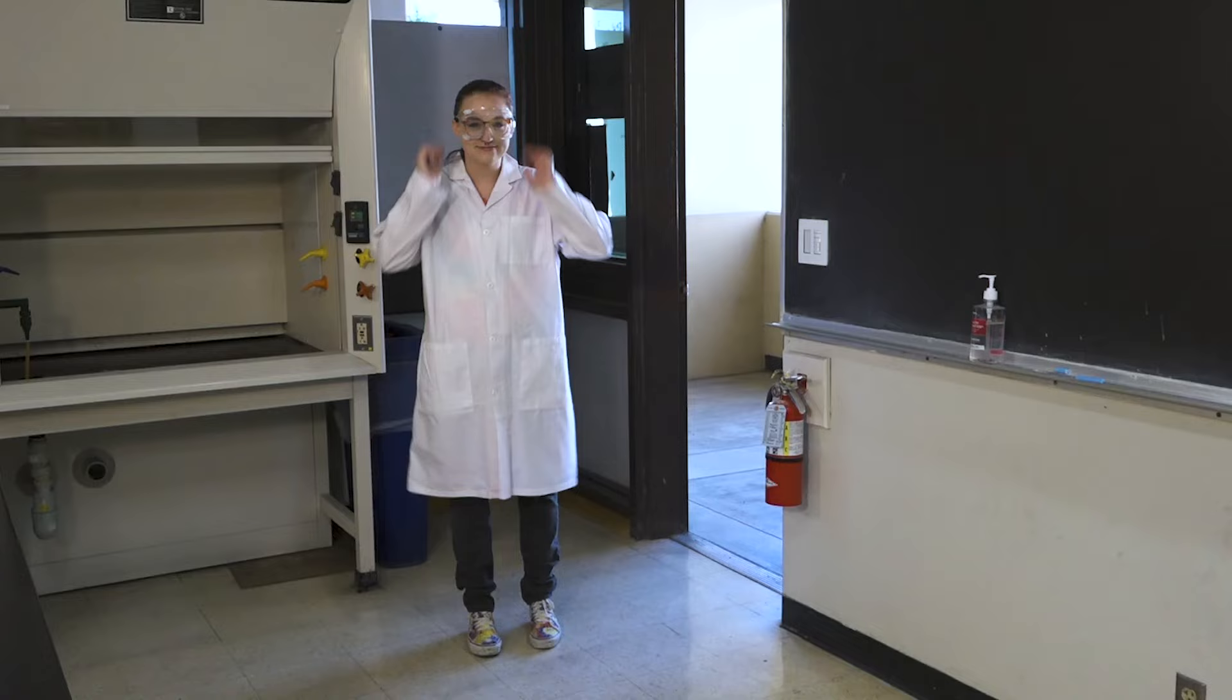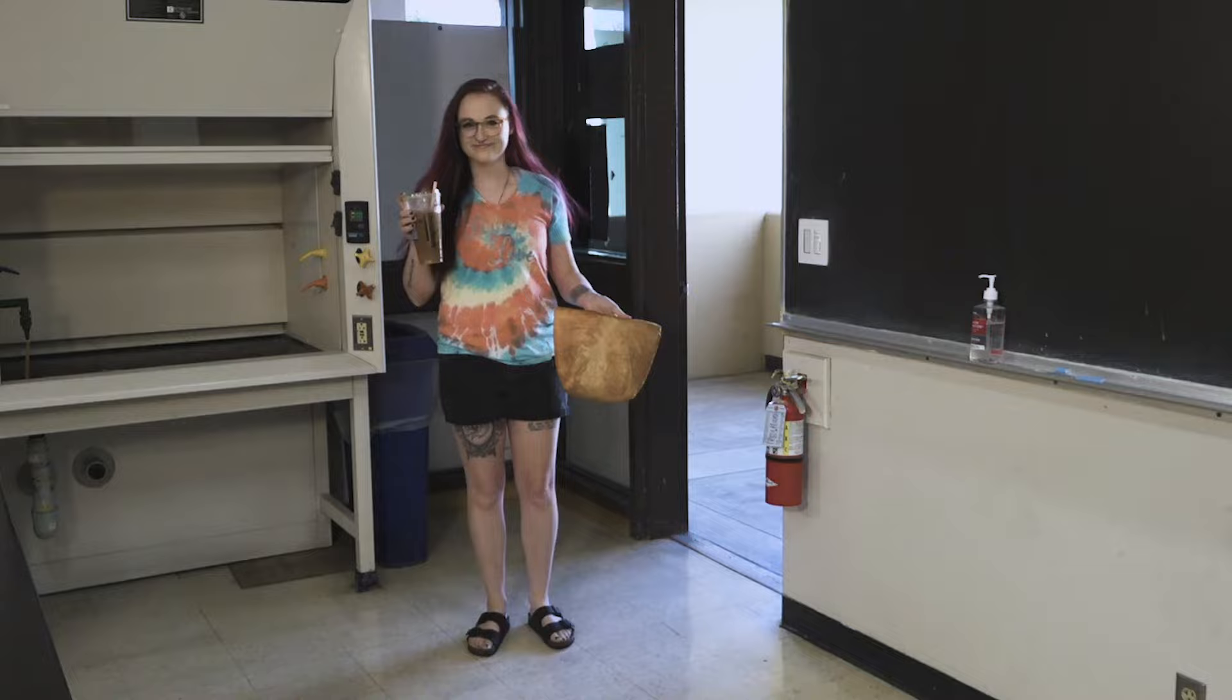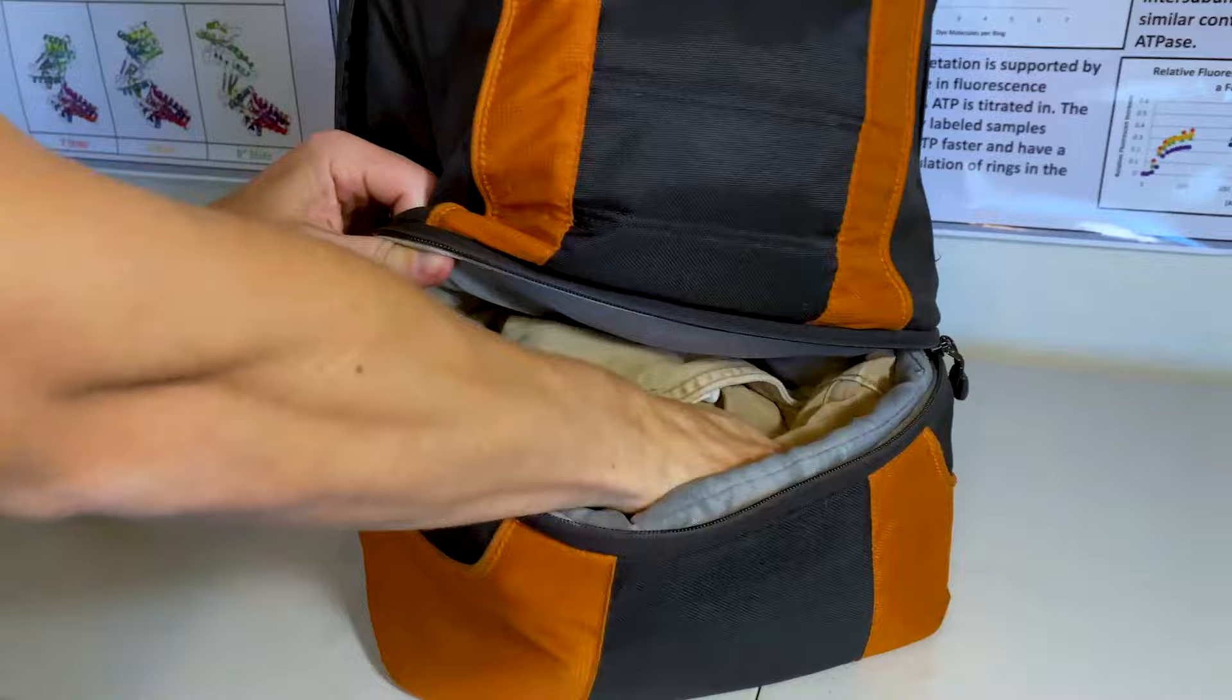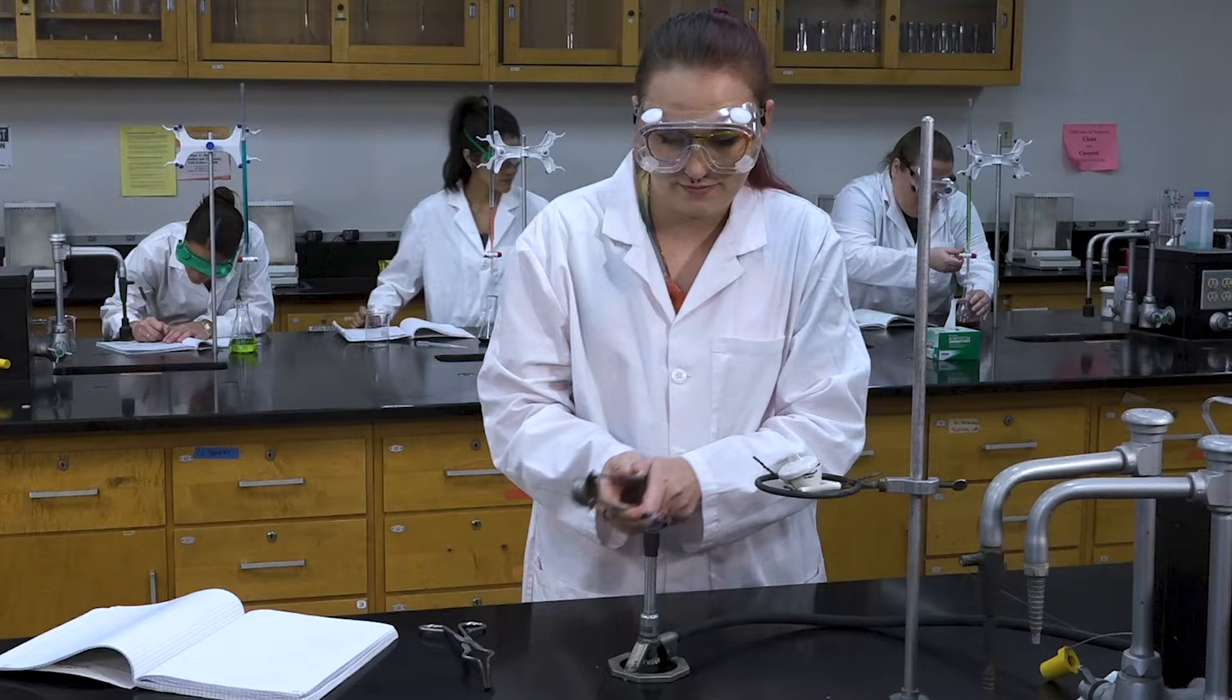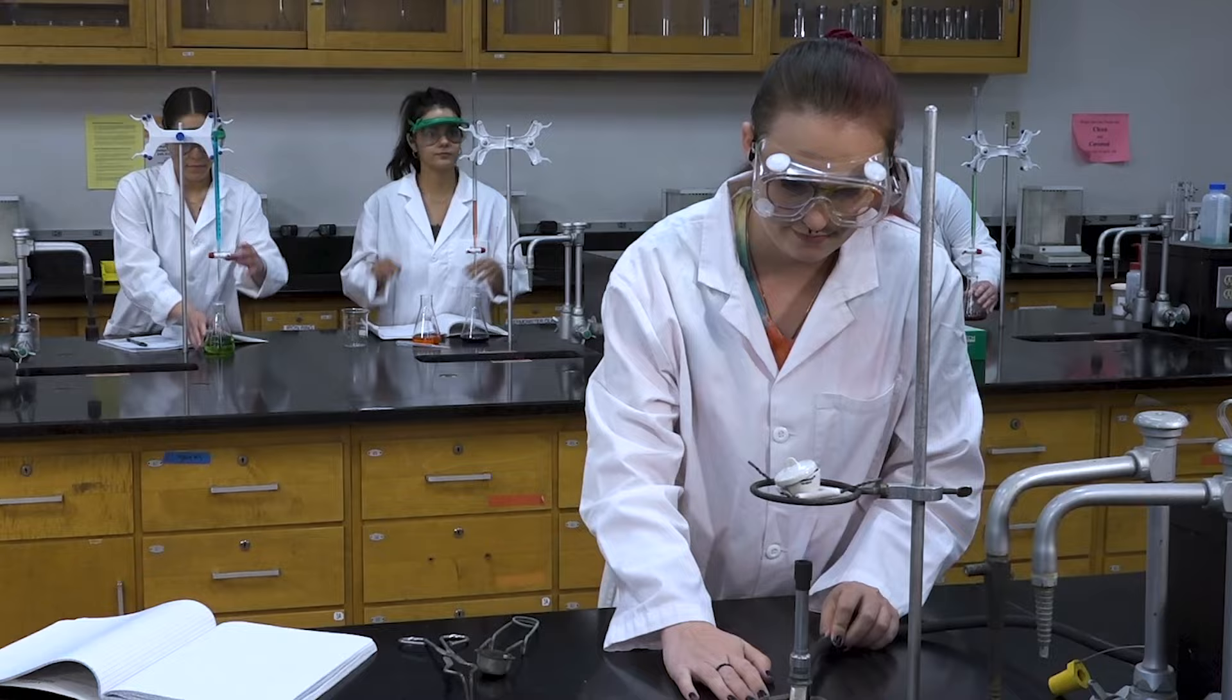If you do not have proper laboratory attire, you will be asked to leave and you will not be able to complete your experiment. It's smart to throw an extra pair of pants and shoes into your backpack or car, just to be safe. Your lab coat and goggles can be stored in the lab. The chemistry lab can be a dangerous place, but many of these dangers can be mitigated by proper laboratory attire.